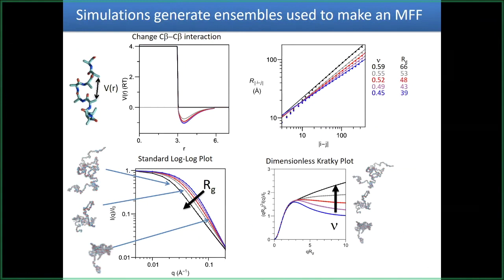So even just by inspection, you can start to see from a dimensionless Kratky plot some of the properties of the polymer, whether it's in a good solvent, theta solvent, or a poor solvent. You can almost do that by examination. What you'd really like to be able to do is to fit it. But anyway, essentially what we've done using simulation is come up with a molecular form factor for extended polymers.